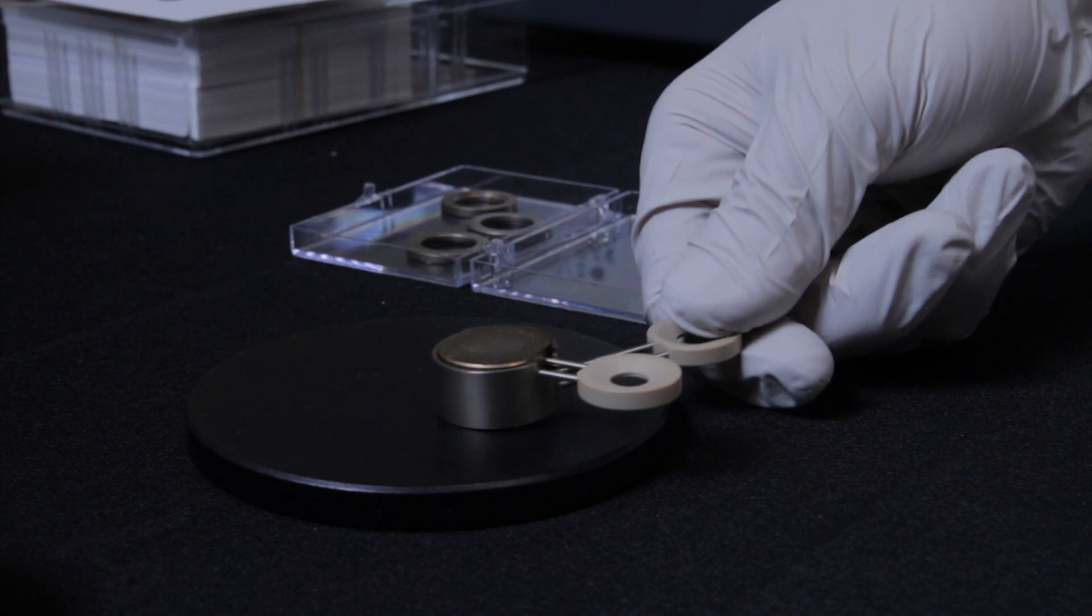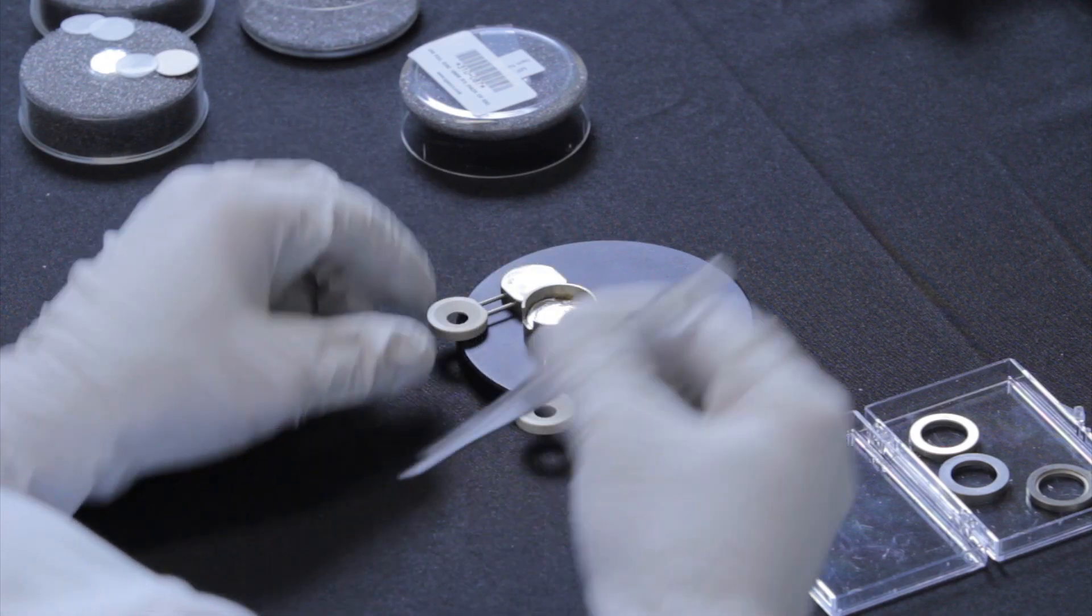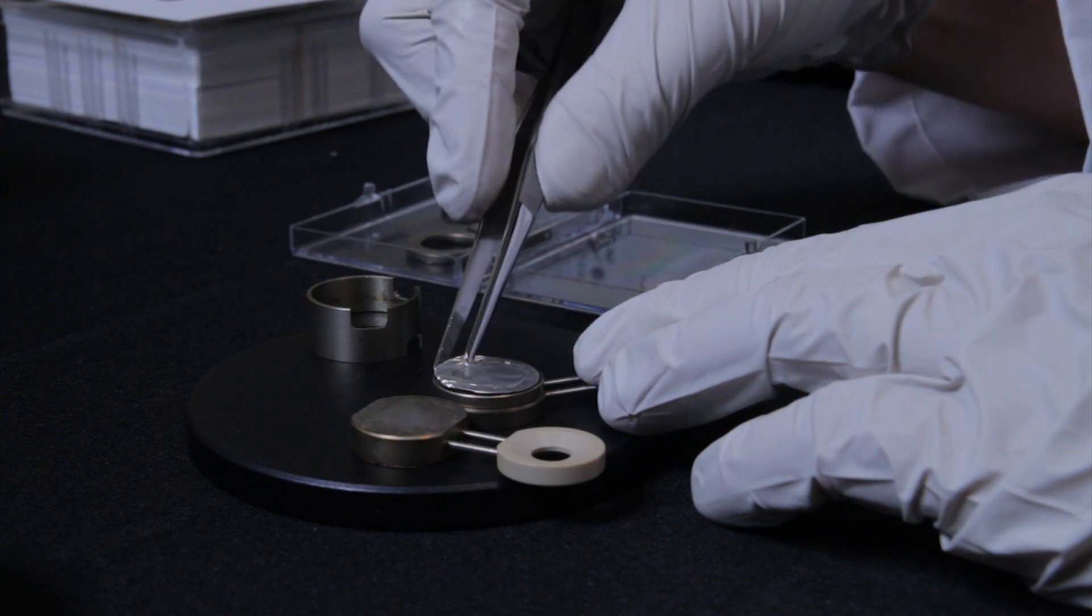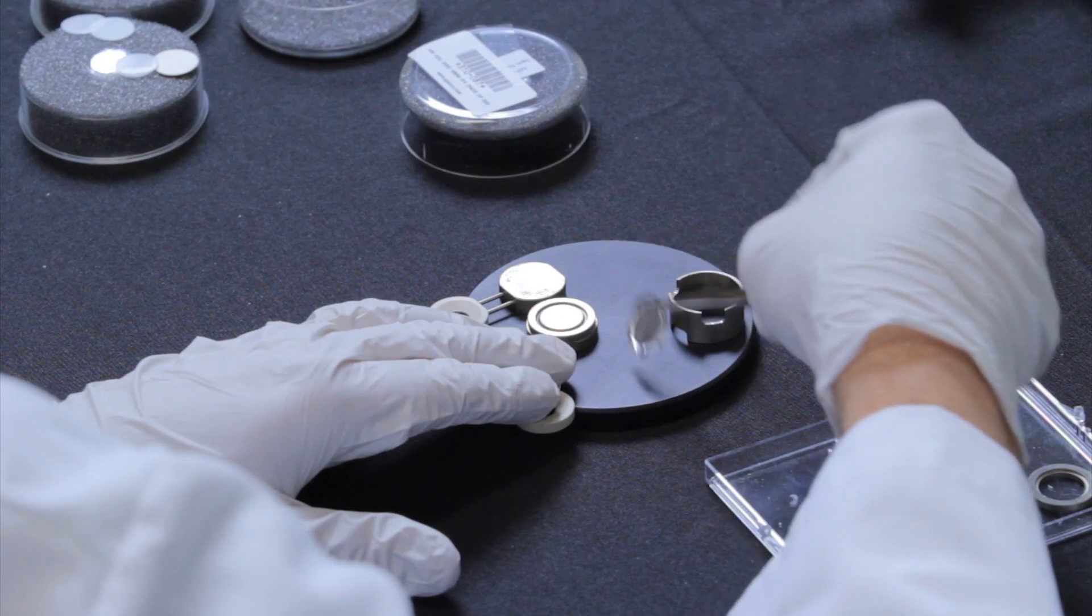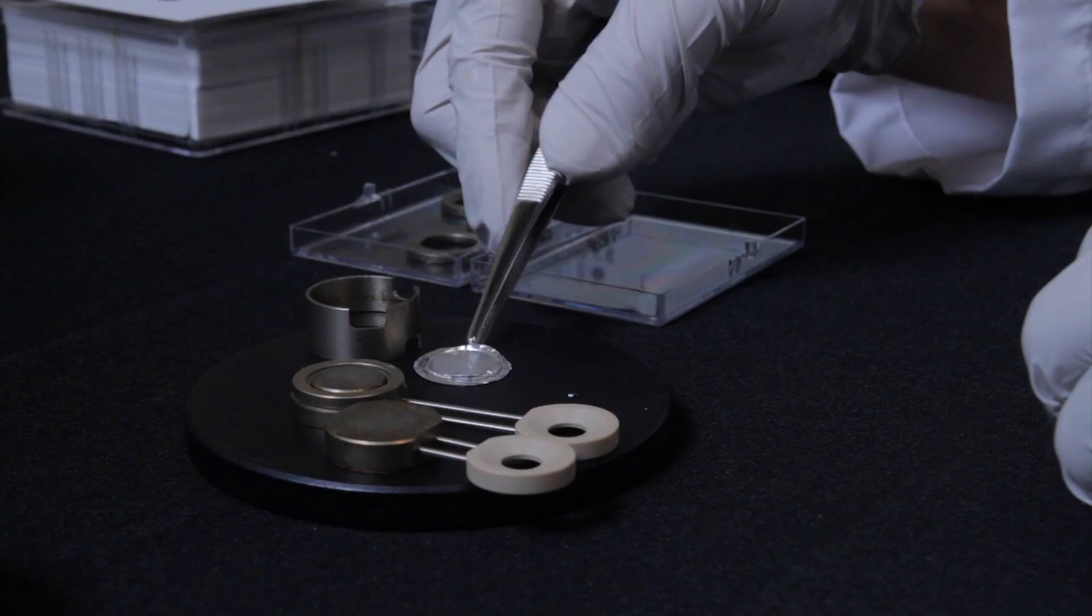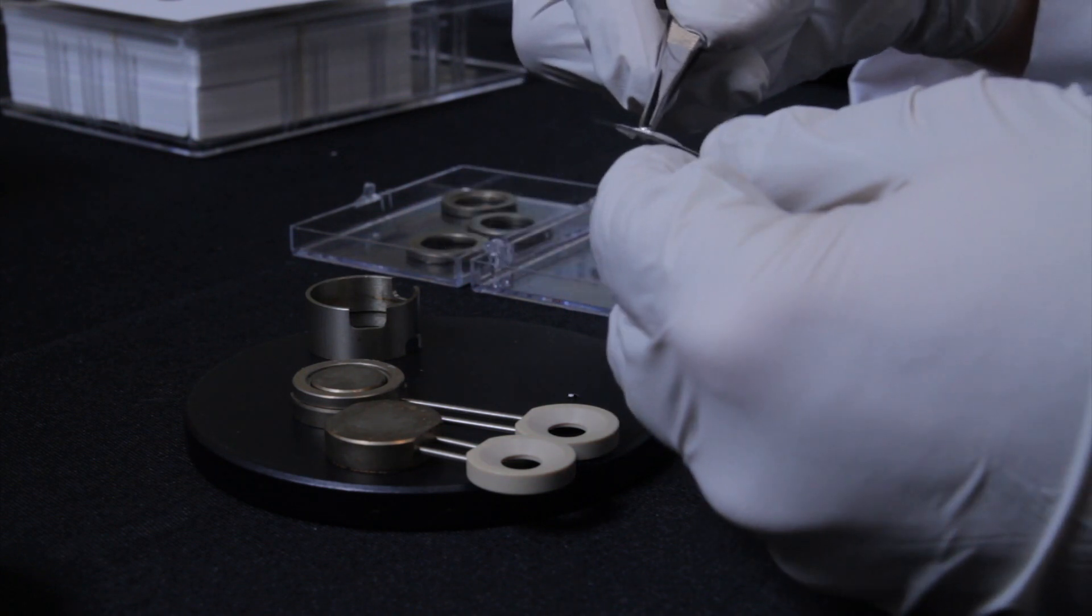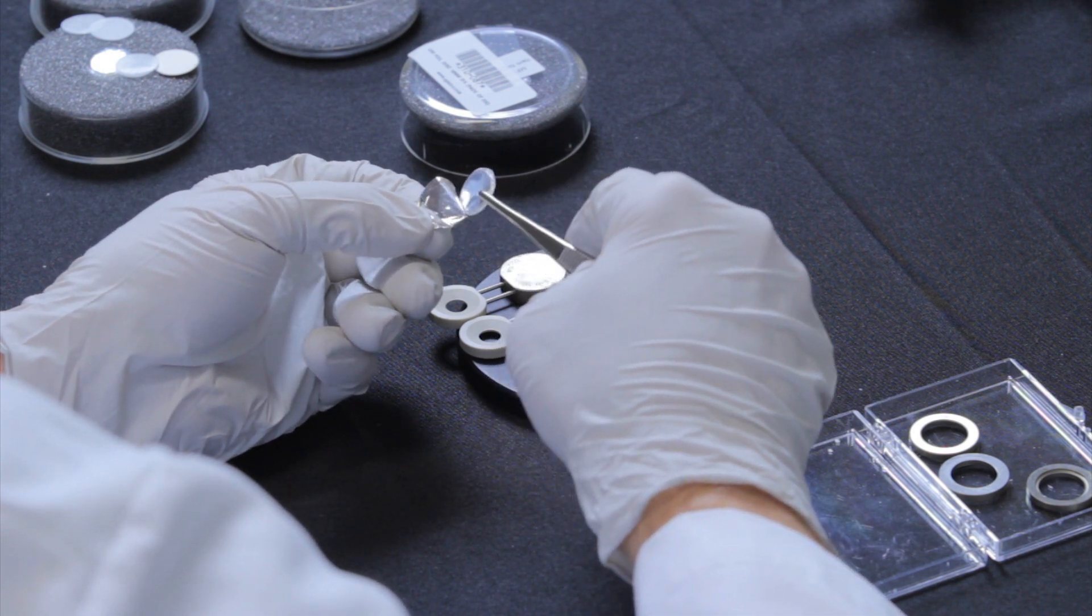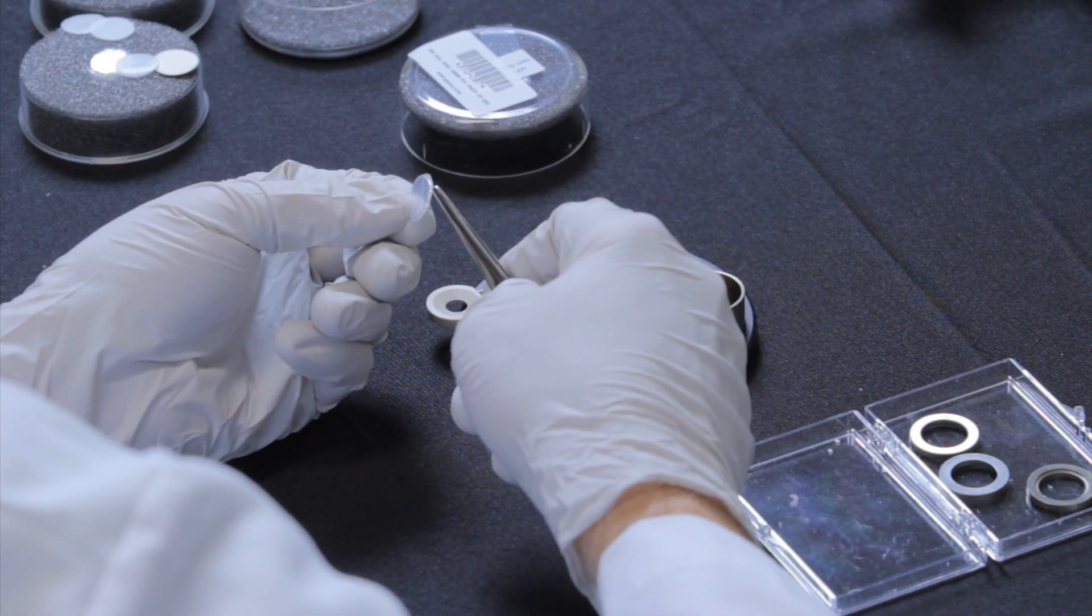Once the film is pressed, we take the apparatus out of the filmmaker and disassemble it. The film is pressed between the two foils. Once we remove the foil, you'll be able to recover the film.